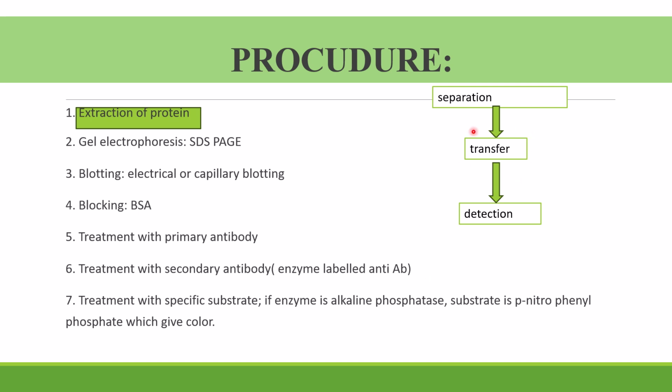The three major things which we have seen: first is separation, next is transfer, and the next one is detection. Separation, transfer and detection. Extraction of proteins. How will you extract proteins? Extraction of proteins is a specific procedure you have to follow.